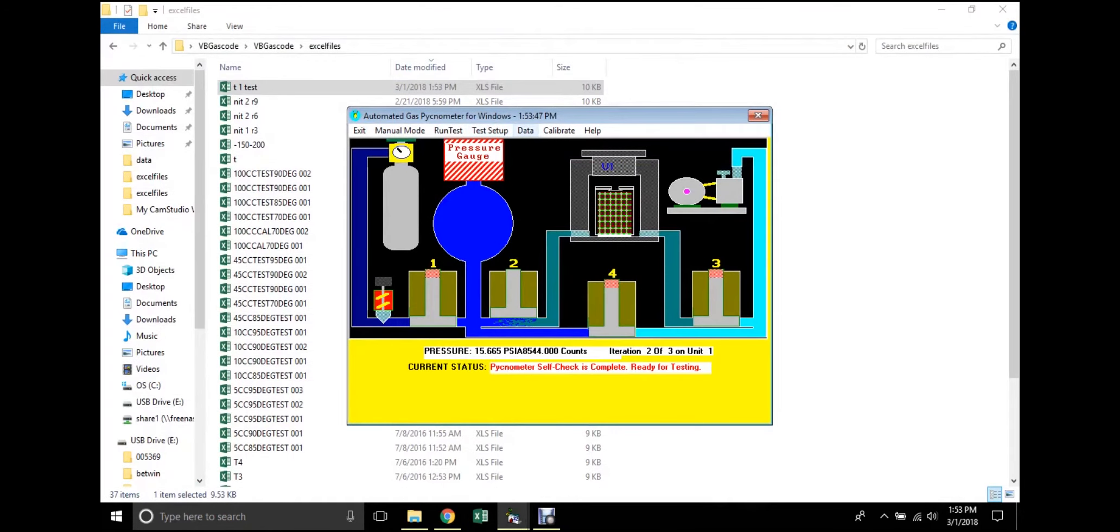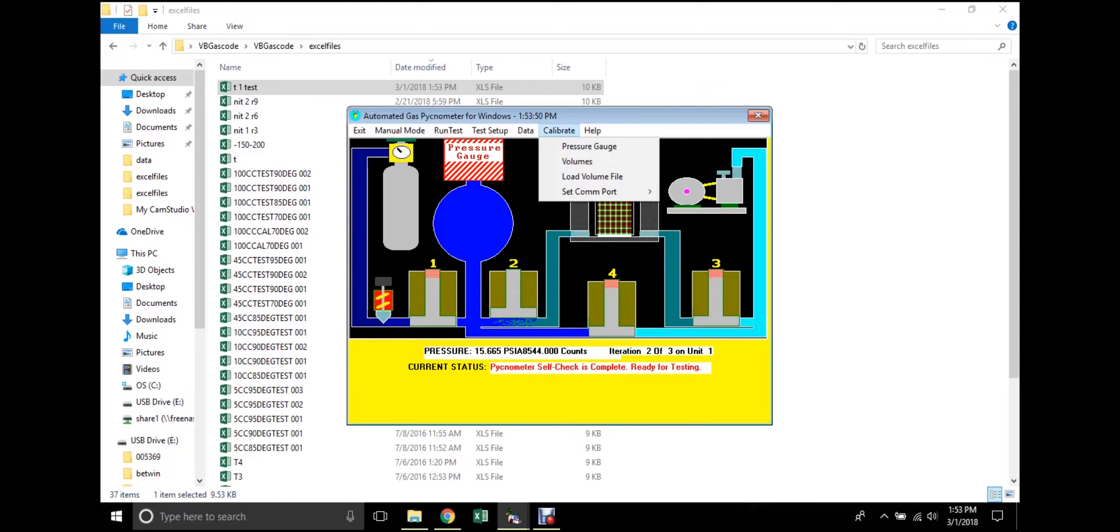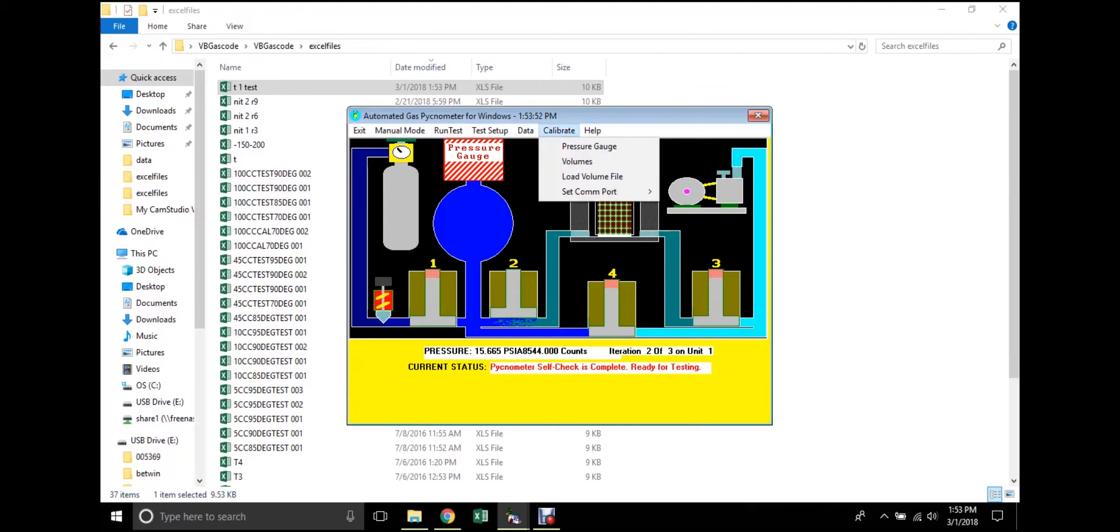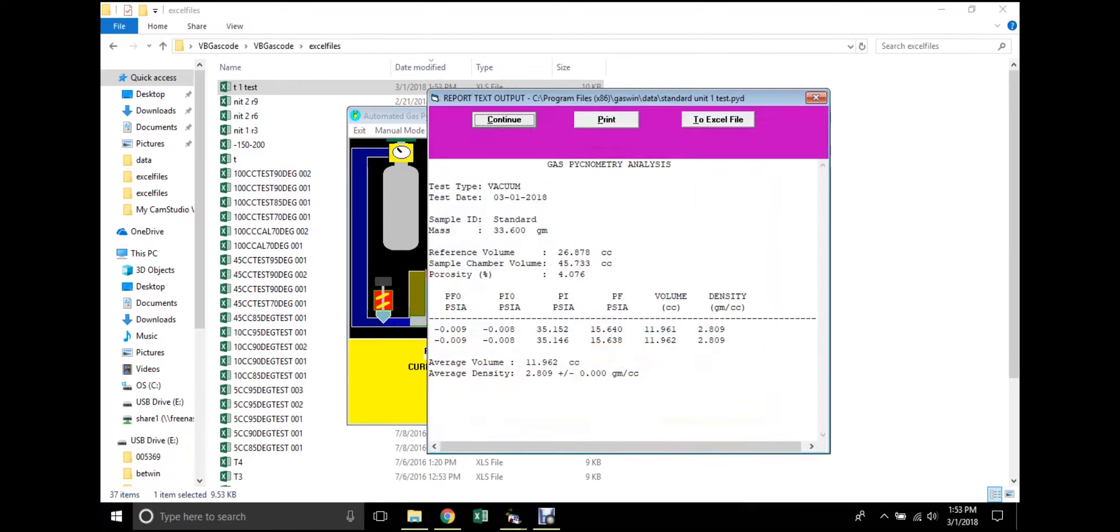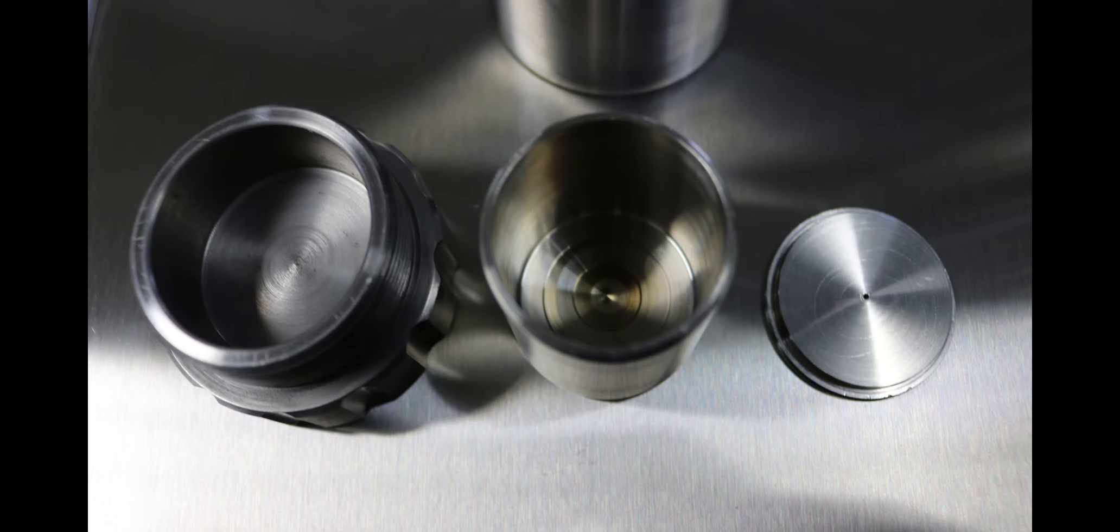The software will automatically save the report for the last test that was run, so it may be brought up later on by clicking data in the menu bar and selecting data file from the drop-down menu.